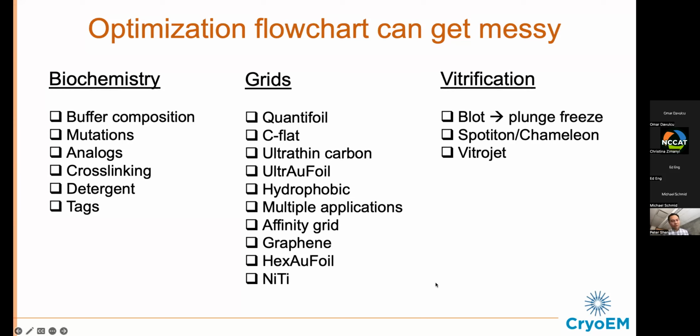And so in cryo-EM 101, we have a section in chapter 3 here where we have a gallery of bad examples. We have good examples, of course, but this is a home where we hope people can learn what bad examples look like.